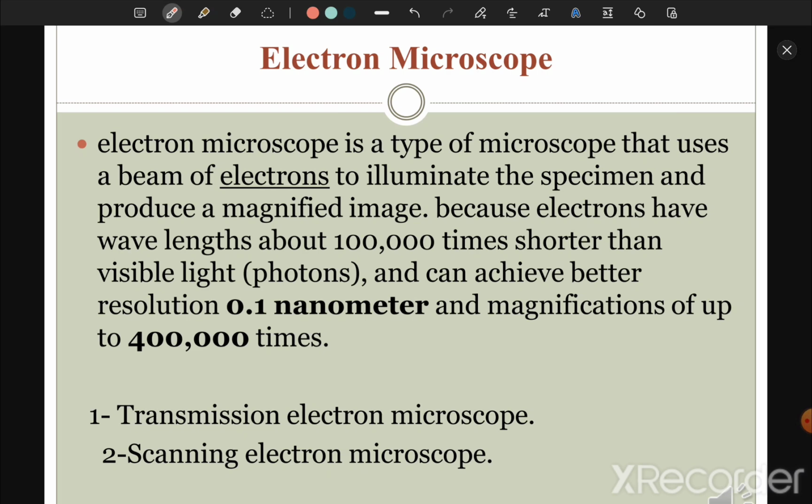It is very sharp. Sometimes 40 to 90 nanometers is needed for the electron microscope. This is a very thin section. Unless you have a very good embedding material and a very professional steel, diamond or glass knife, as in the microtome specialized for the electron microscope, you cannot get it.